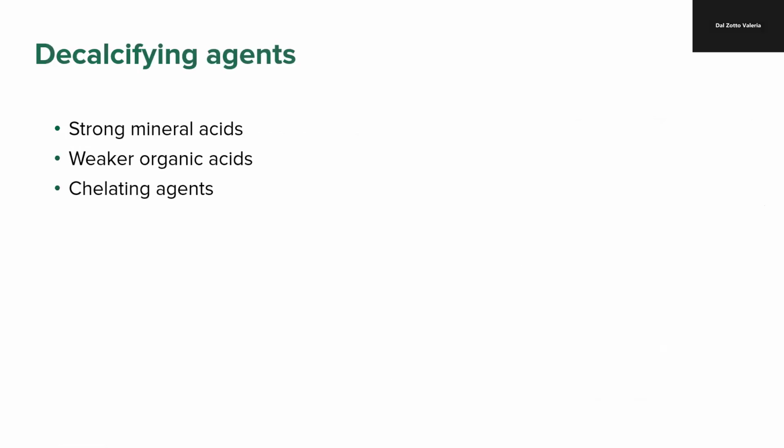Let's go to the proper decalcifying agents. How are you going to use the different decalcifying agents that we have in the grossing room? Decalcifying agents can be classified as strong mineral acids, weaker organic acids, and chelating agents.